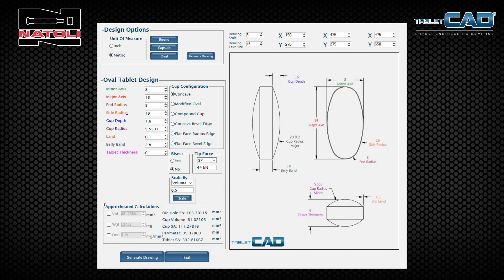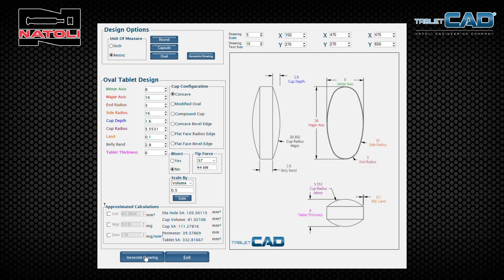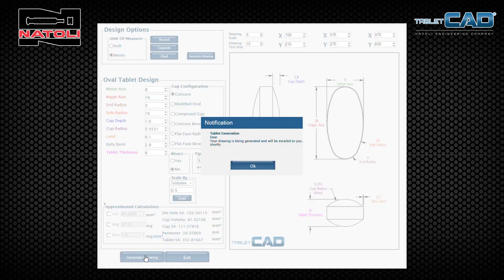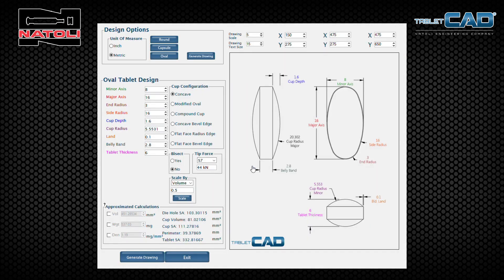Once you've designed a tablet and it is finalized, you can save it by clicking on generate drawing. Tablet CAD generates a PDF of this tablet drawing and emails it to your registered email address.